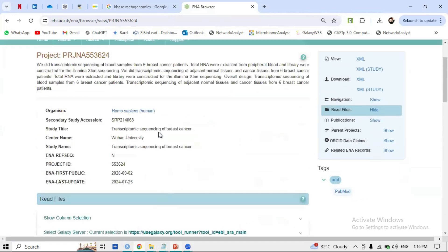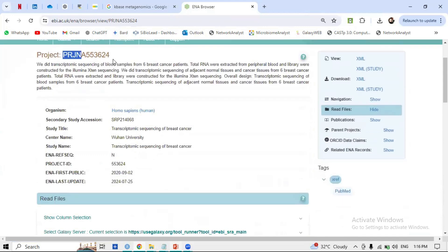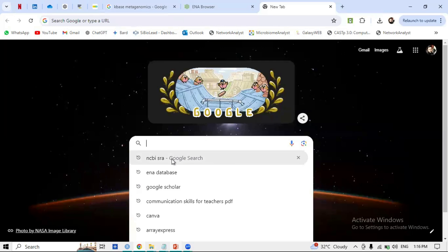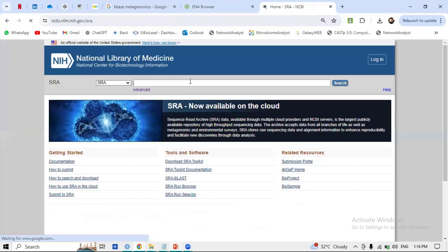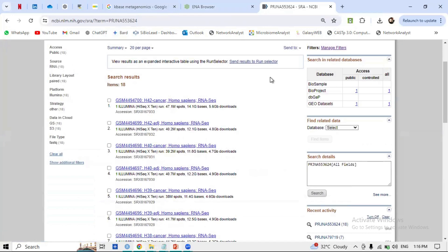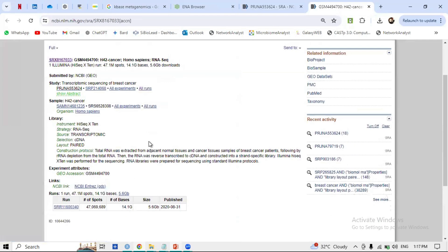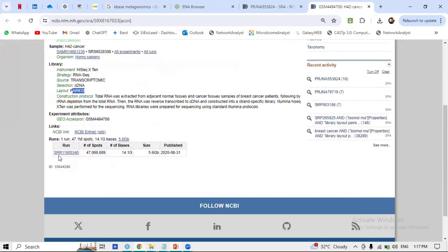To check this study more descriptively, copy the accession number and go to NCBI SRA. Type the accession number and search. This study consists of 18 paired-end samples, RNA-seq, and the files are publicly available FASTQ files. Click on a single sample: it shows HiSeq X10, RNA-seq, transcriptomic, complementary DNA, paired-end. The SRR ID, e.g., SRR11600340, is the identifier of a single FASTQ file.